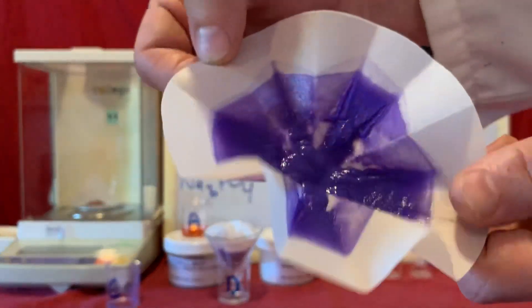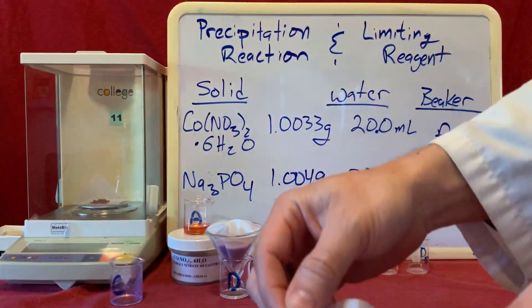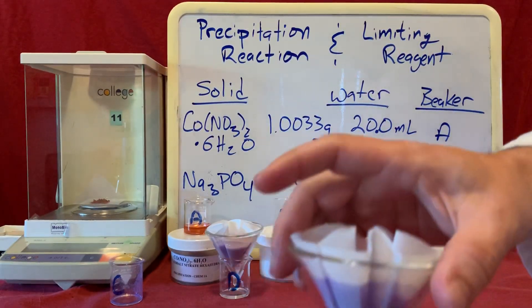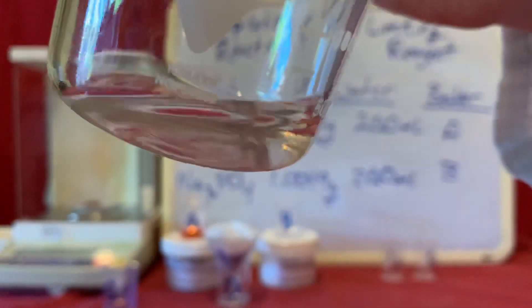Take that out and look at it. You can still see it's a little wet. And my supernatant that's been separated out.